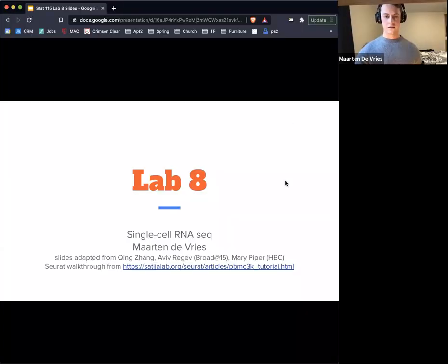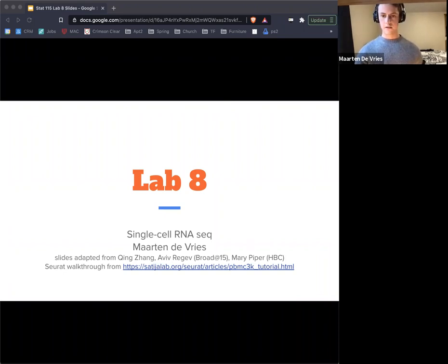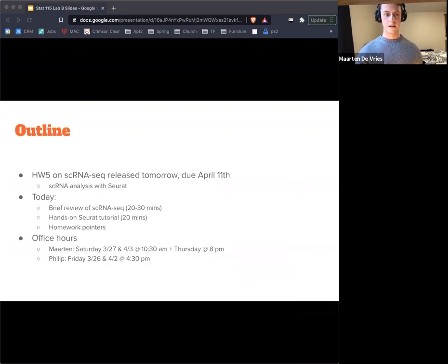Okay, I'm gonna share my screen. Let's see if that works. Okay. All right. So today we're going to talk about single-cell RNA-seq, and tomorrow there will be a homework coming out. I think it's due April 11th. Don't quote me on that. It might change a little bit, but I think it's the 11th.